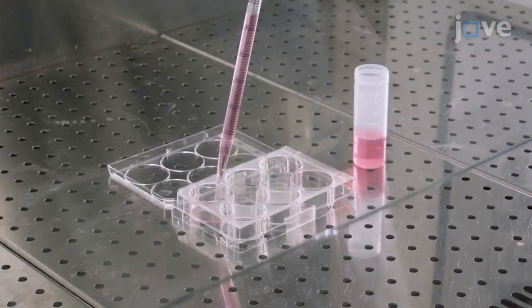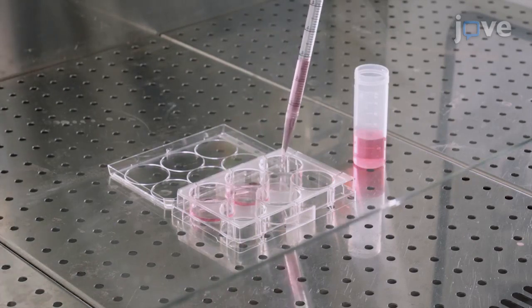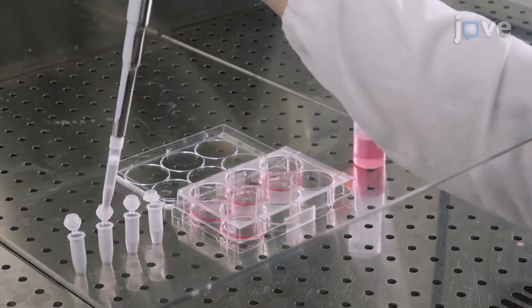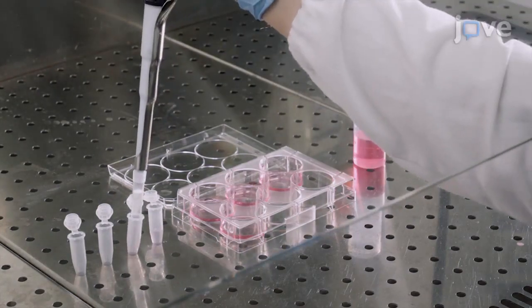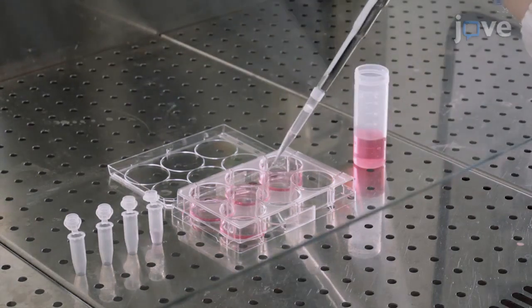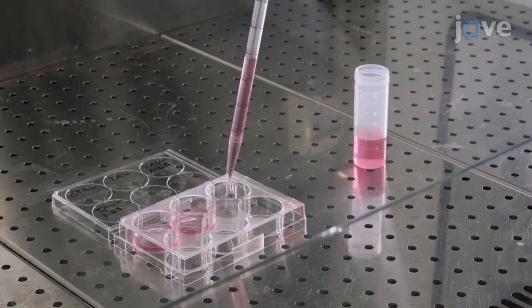At the end of the incubation, replace the supernatants in each well with 2 milliliters of fresh complete culture medium and transfect each well with the appropriate DNA lipid complex solution for an overnight incubation at 37 degrees Celsius. The next day, replace the supernatants with fresh differentiation medium.